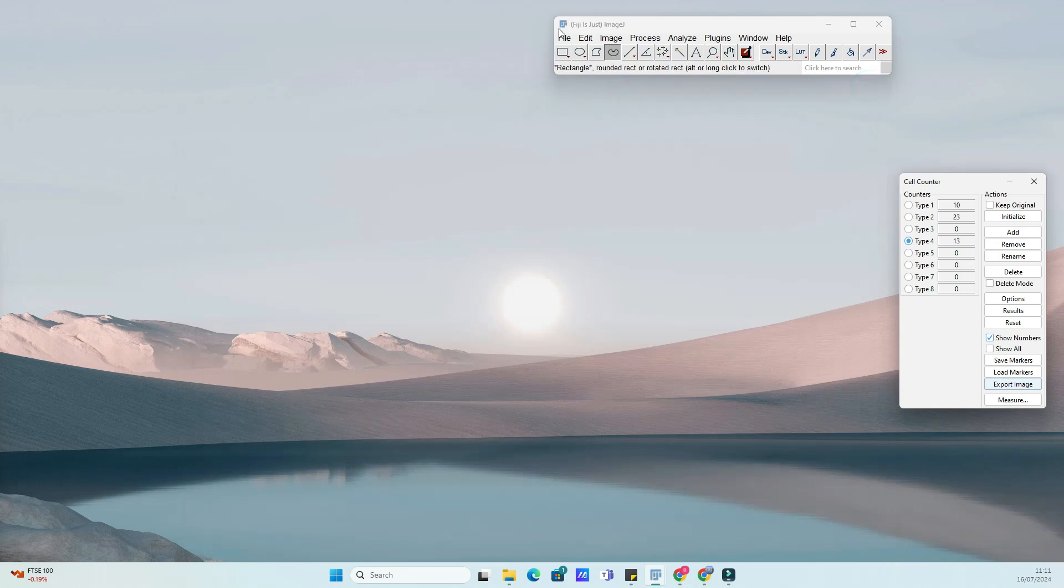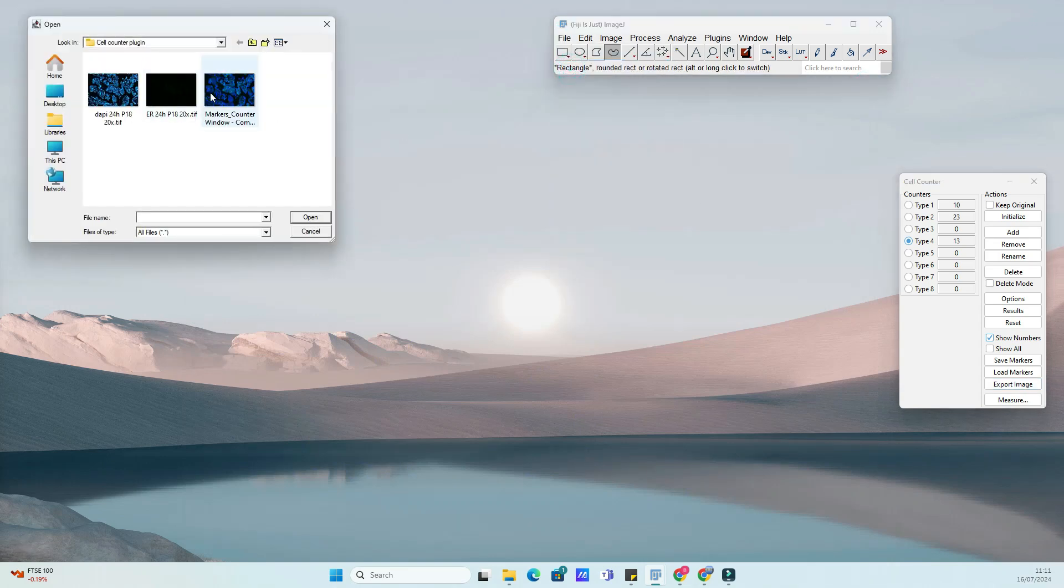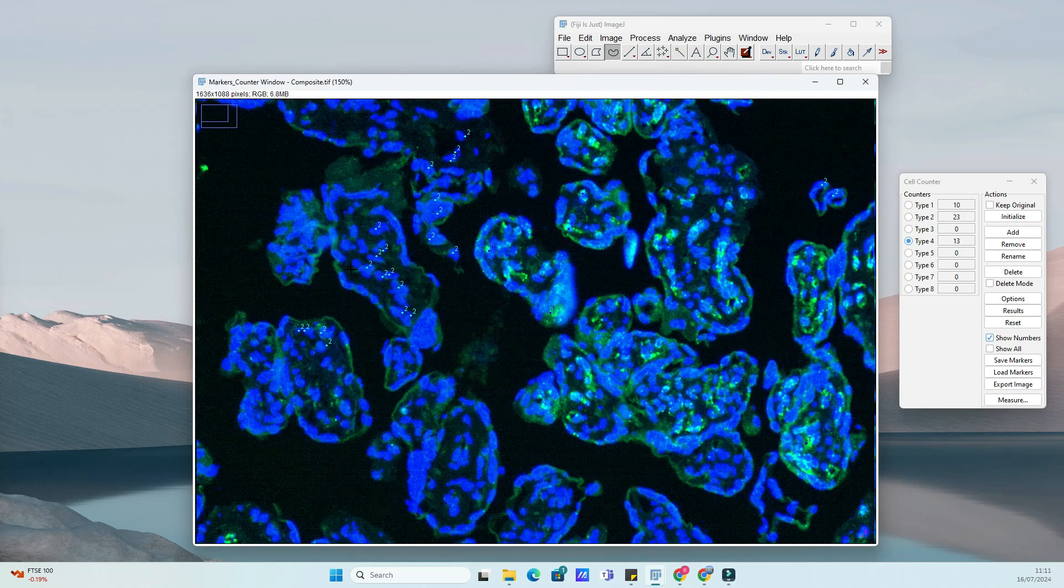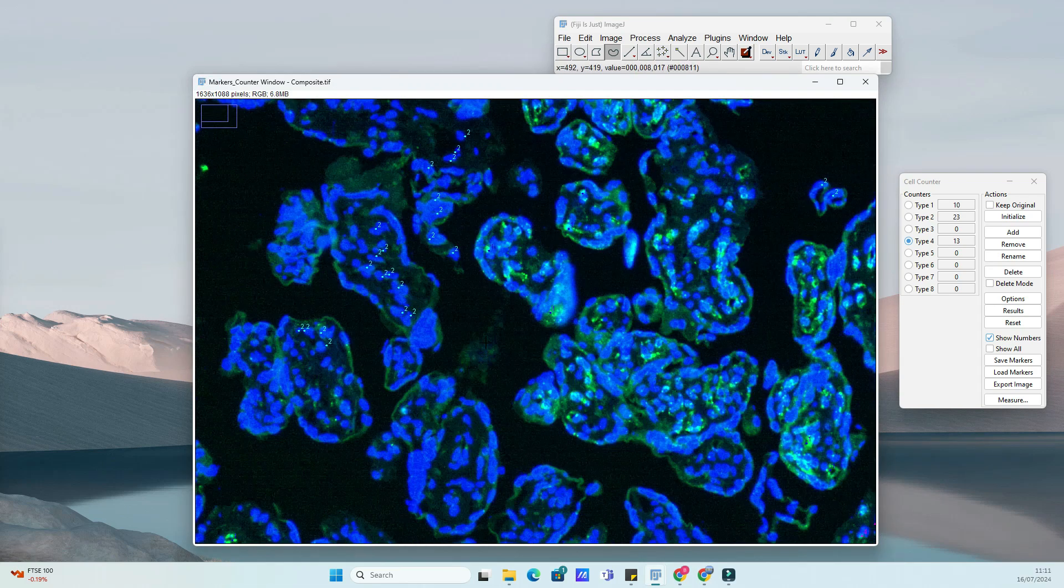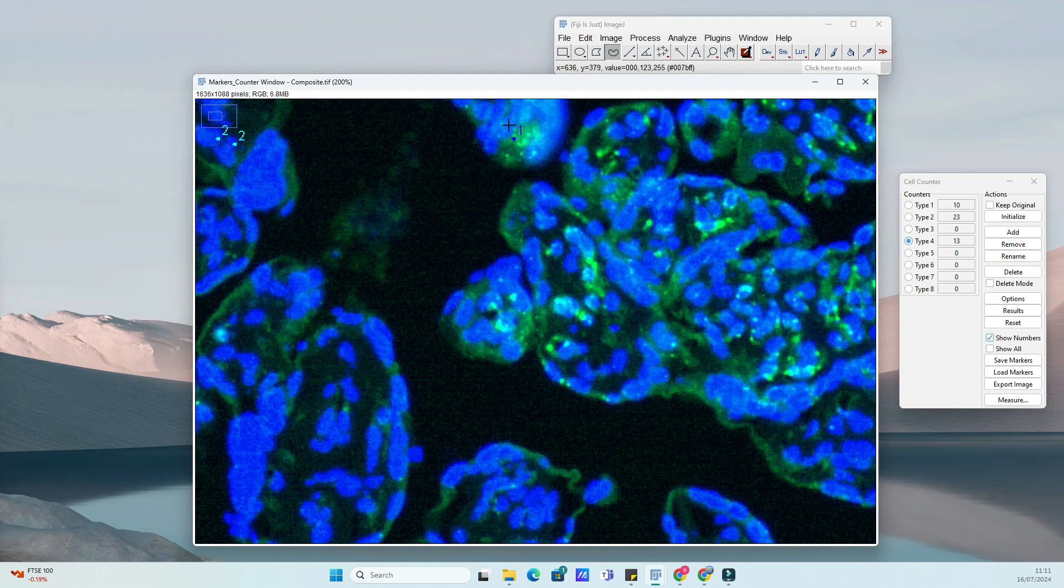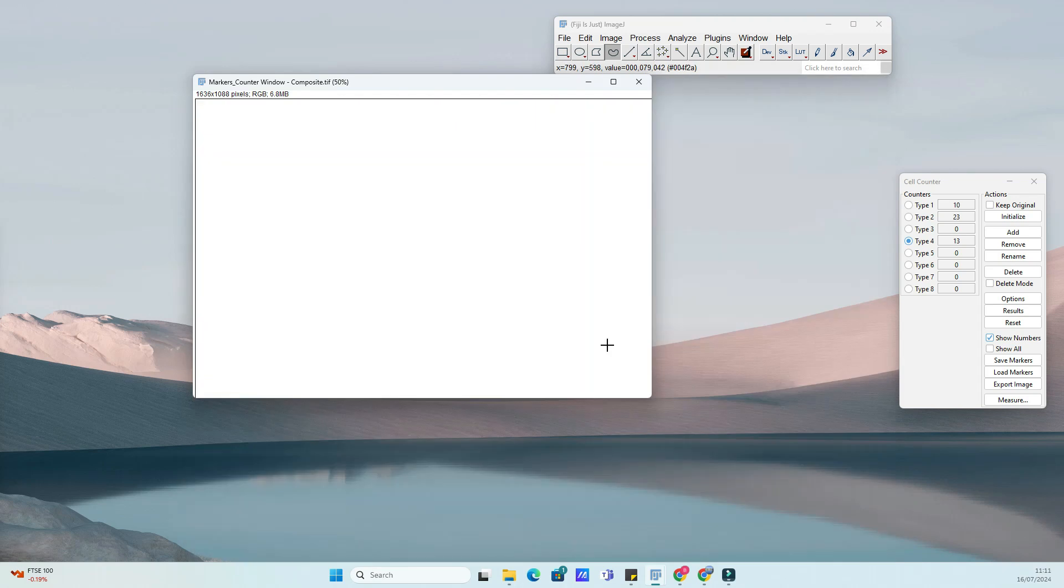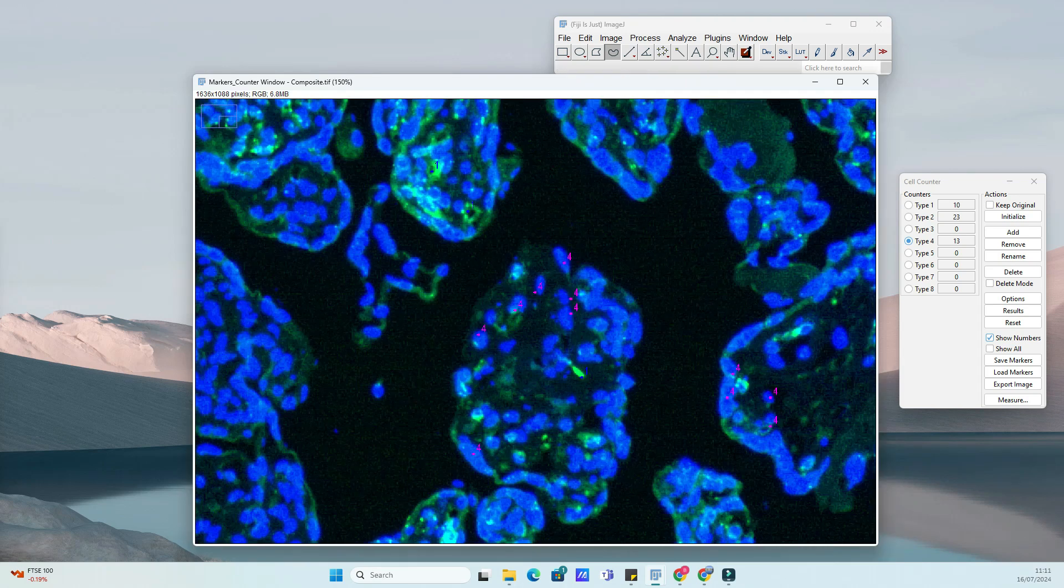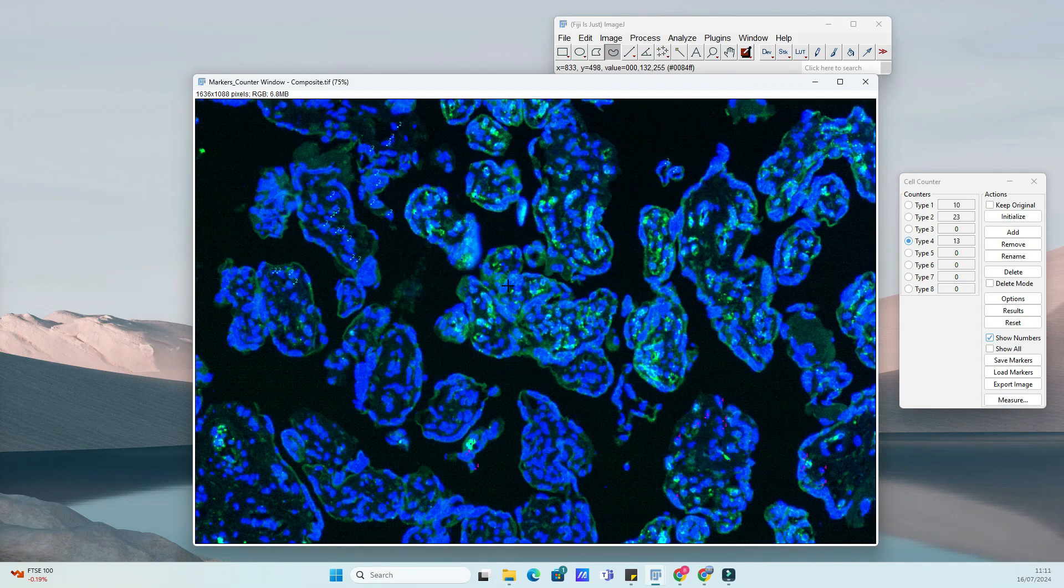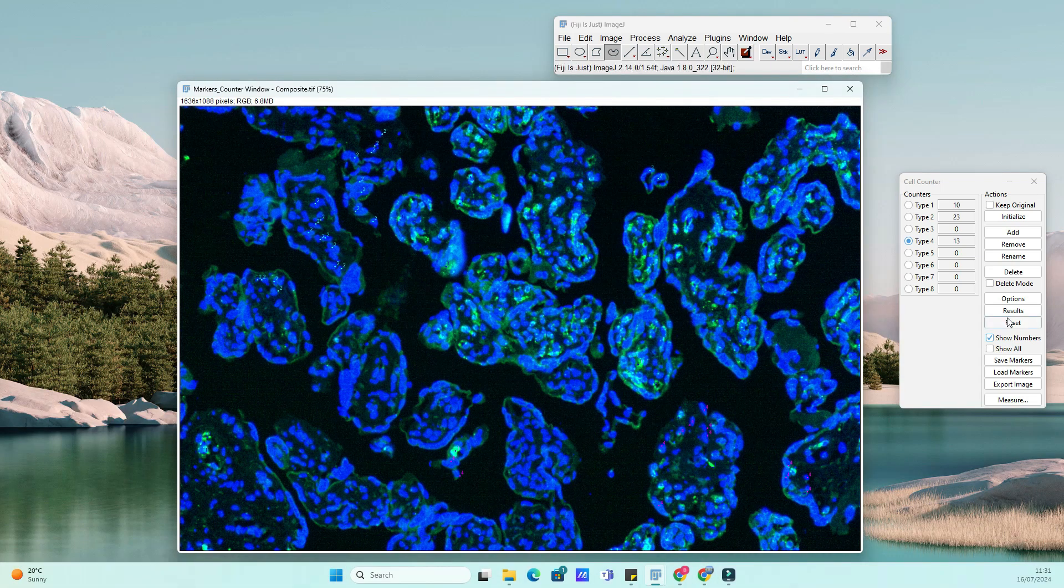And there you have it. The Cell Counter plugin in ImageJ is an invaluable tool for any biologist or researcher needing accurate cell counts. Whether you're studying cell proliferation, tissue samples, or complex microscopy images, this plugin will streamline your workflow and enhance the accuracy of your data.